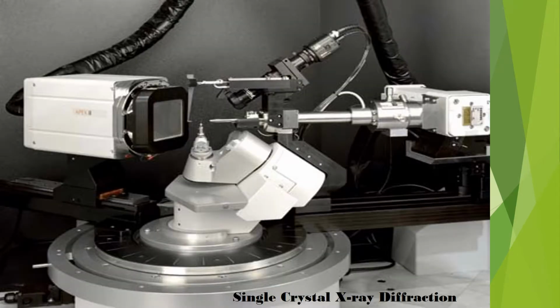Here is a single crystal X-ray diffraction instrument which is used to determine the structure of the single crystal, and in this machine there is an X-ray tube and a goniometer on which the single crystal is mounted, and a detector which records the scattered beam after striking the single crystal.